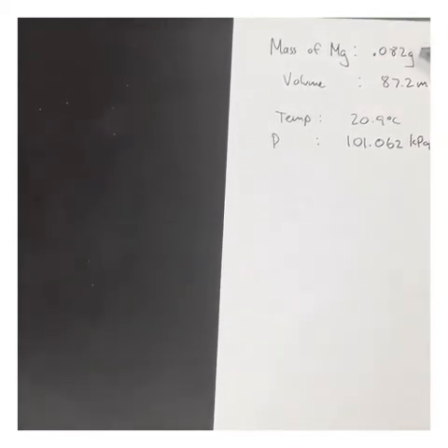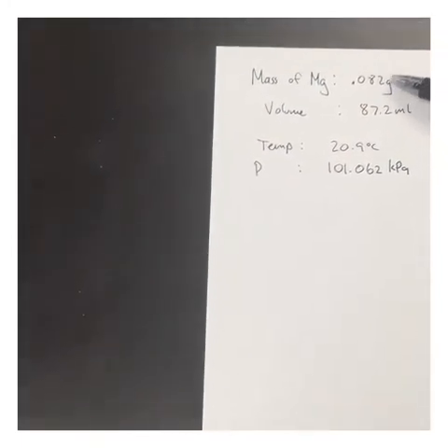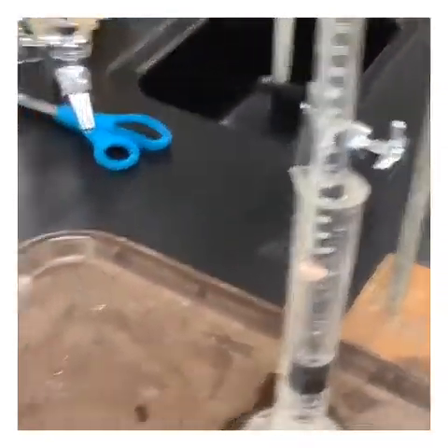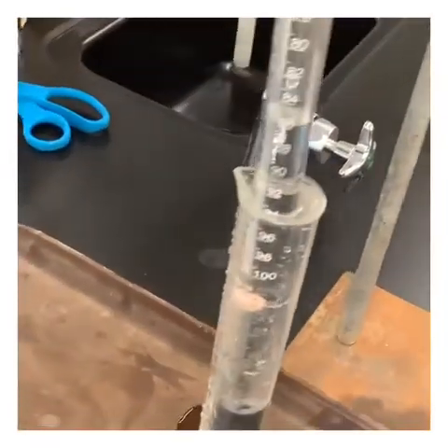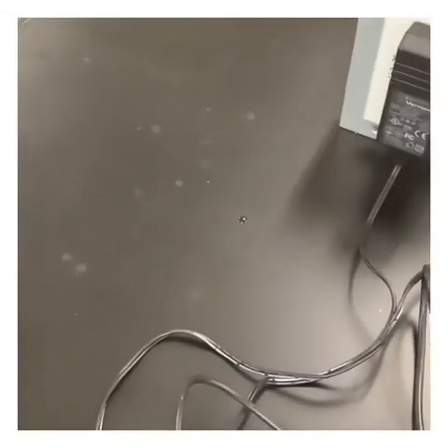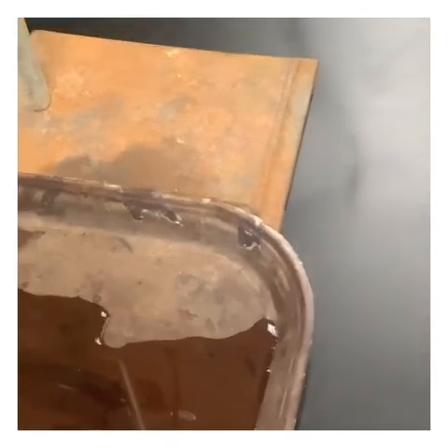But look what we have here, right? We have magnesium. We know this. This mass right here was measured on an extremely expensive scale. I have more confidence in that than I do this eudiometer, right? That could maybe go to 1 or 2 decimals. So what, maybe 2 decimals on that? So let's see. No, I guess 1 decimal for that. I'll have to look a little closer at it again. You guys measured it, you should know. But for this, what did I put? I put 0.251. Yeah, I guess about 1 decimal.